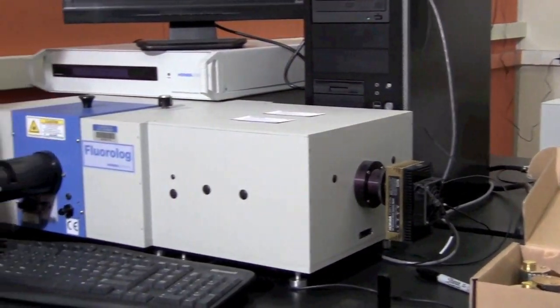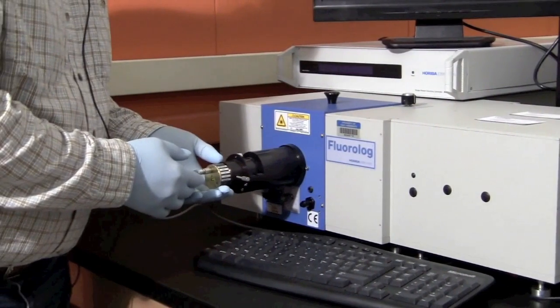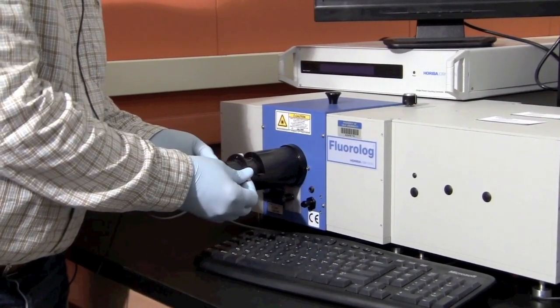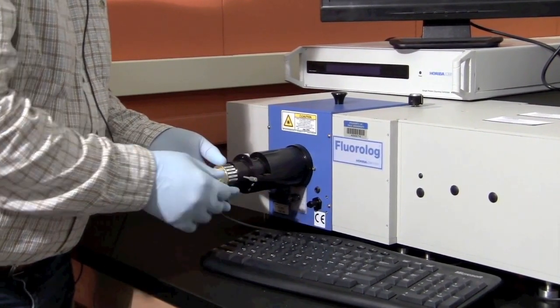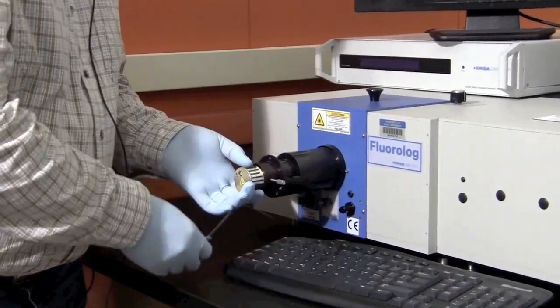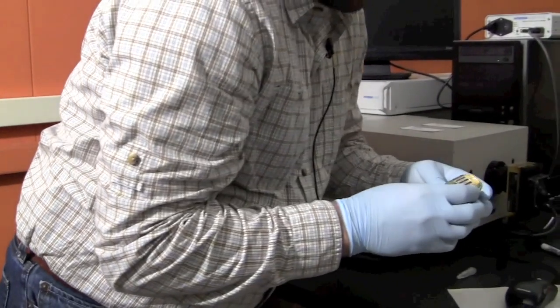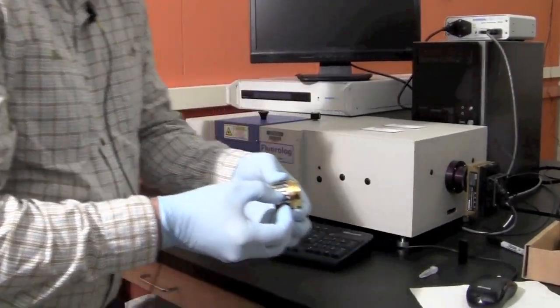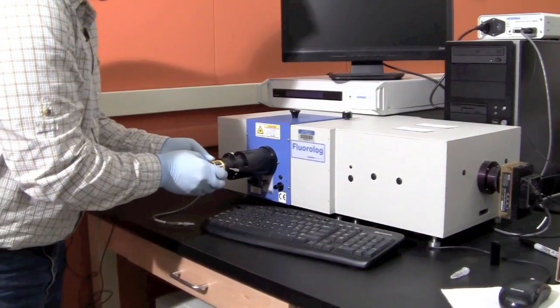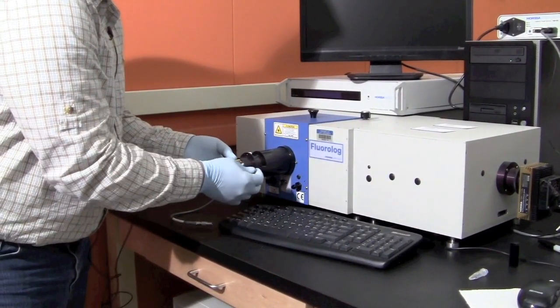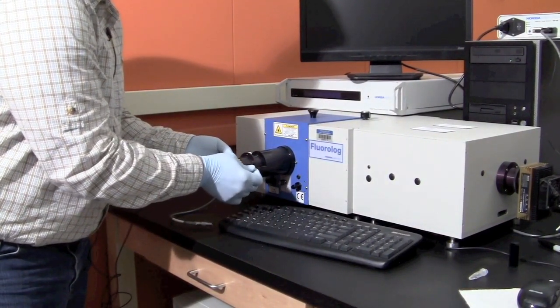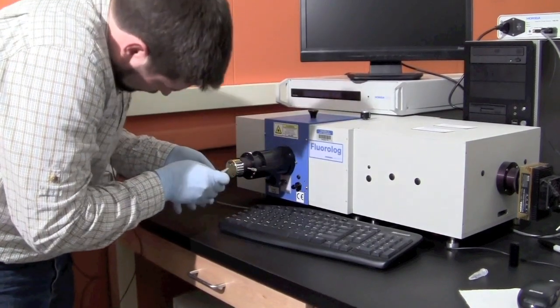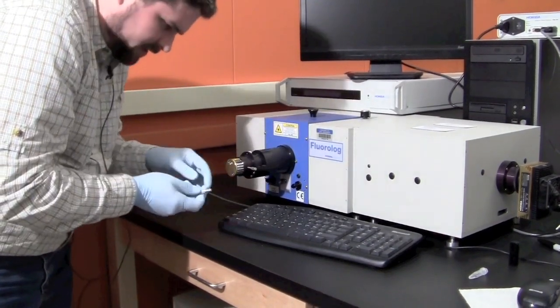To remove the nano LED already on the instrument, loosen the set screw and pull out the plug. Then take the next one. This one is 459. Place it in the instrument, tighten the set screw, and put the plug in here.